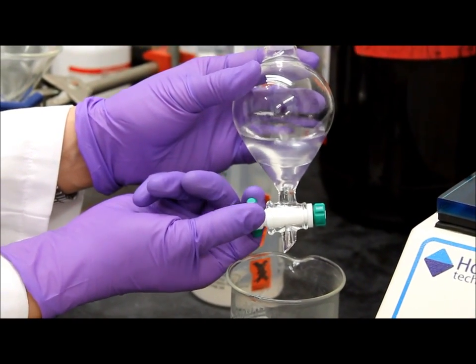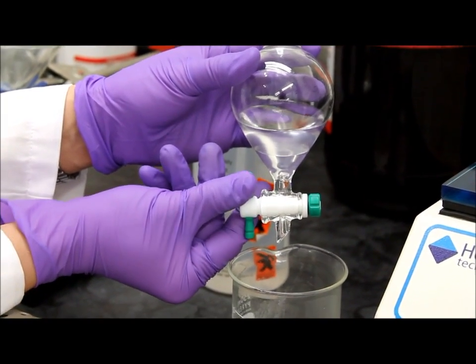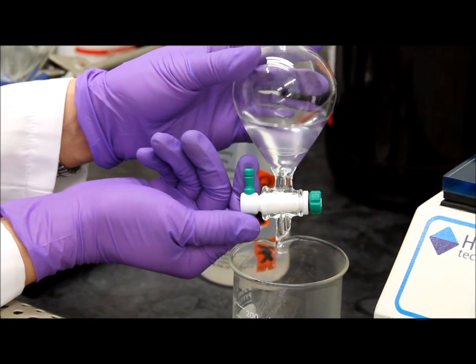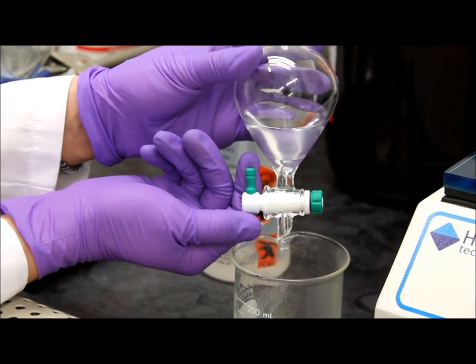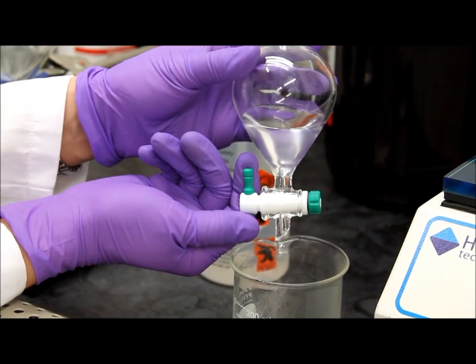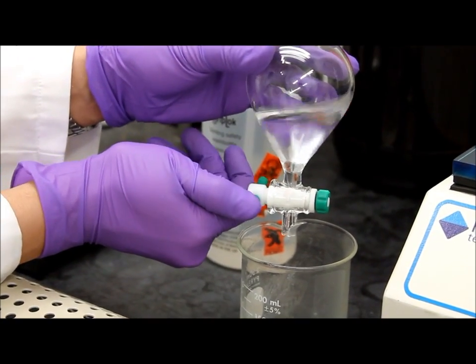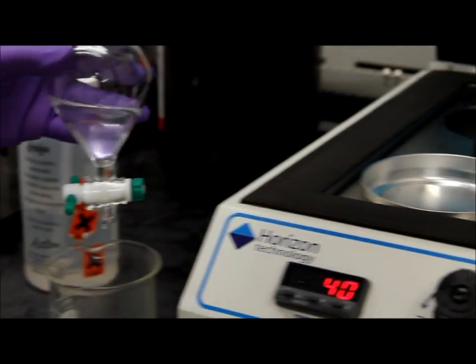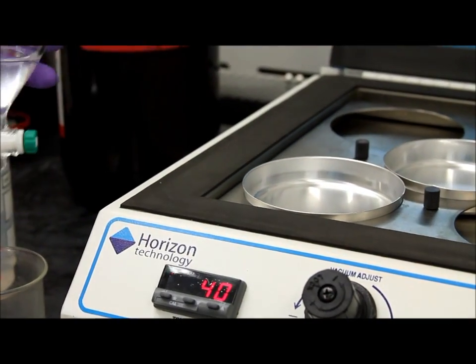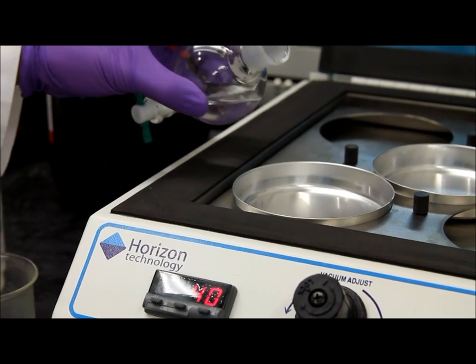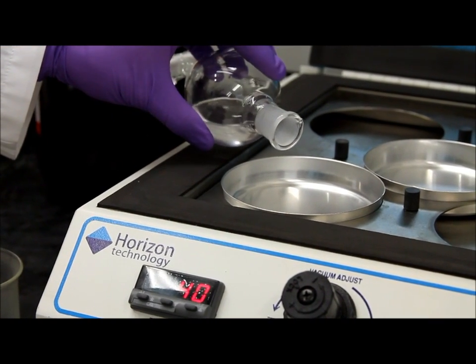So here I am draining out the excess water through the sub funnel. You want to drain as much water as possible without losing any extracts. Once that's done, pour the extract in a pre-weighed pan into the speed bath.